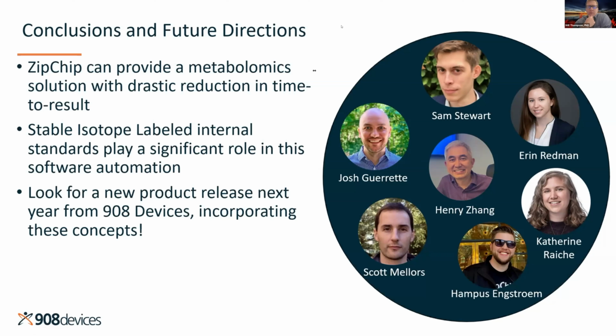Yeah, sure. So currently the data is provided as a micromolar or quantitative output file. So the data is just delivered as a matrix of quantitative values in each sample. But also, we provide a Skyline file on the back end for the purposes of digging into the data if you'd like to see what we've done to the data during our processing.